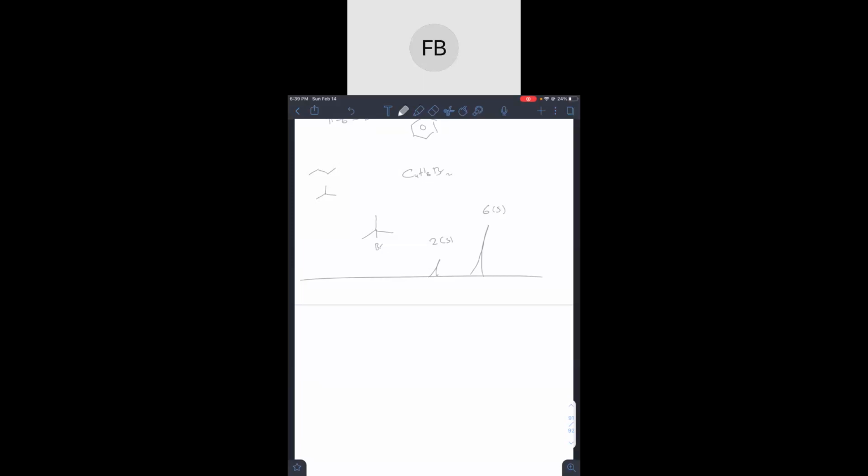Okay, but let's walk through quickly so that we're saying out loud exactly what you're thinking. What Ollie's thinking is, I'll make 6 hydrogens adjacent to 0 hydrogens, so that's our 6 singlet. Then he's thinking, if I put a Br here, that makes these 2 hydrogens also adjacent to 0 hydrogens, so a 2 singlet. Good job. Yeah, this is the correct answer. So again, at the end, always check your work, make sure that it follows through and matches with the graph.